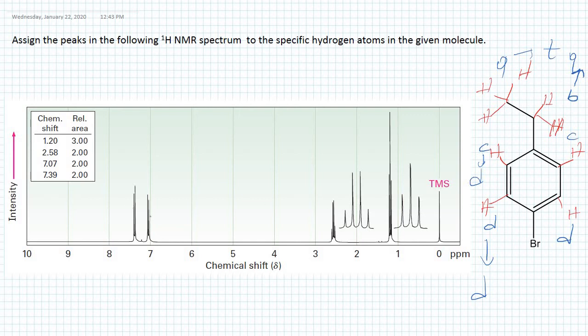So let's look at the spectrum, and let's find. We have 1, 2, and here the third set, which is here enlarged. The peaks are enlarged or zoomed, so we can see 1, 2, 3, 4 peaks. So this is a quartet. And let's see, this is another set of peaks, and if we zoom in here, they are actually appearing as a triplet. So this signal is coming from the internal reference tetramethylsilane. Okay, so quartet, triplet. Here looks like doublet and doublet.